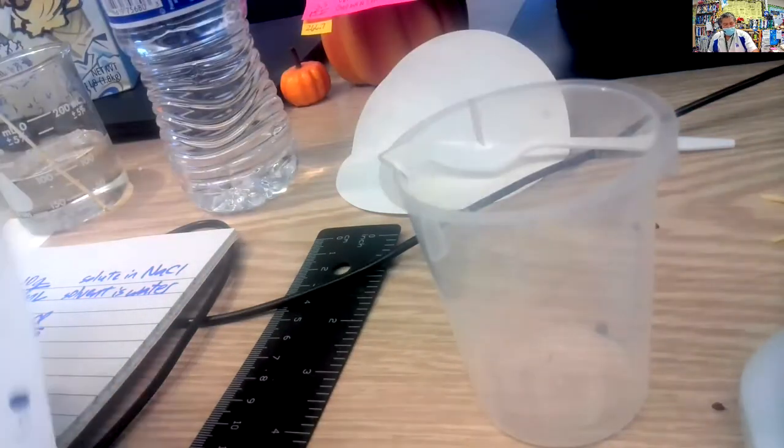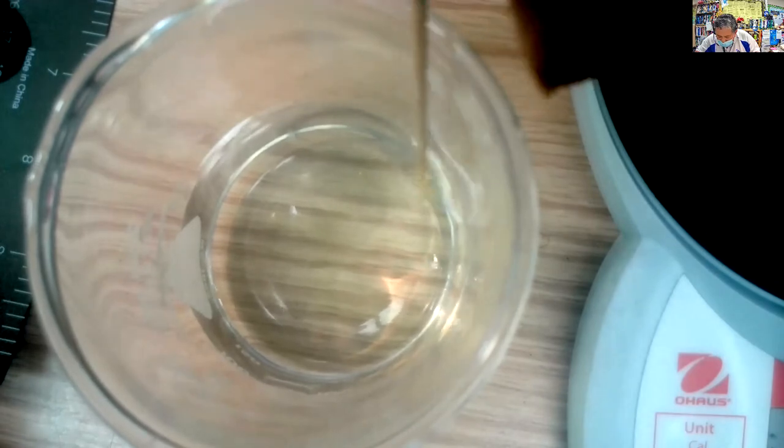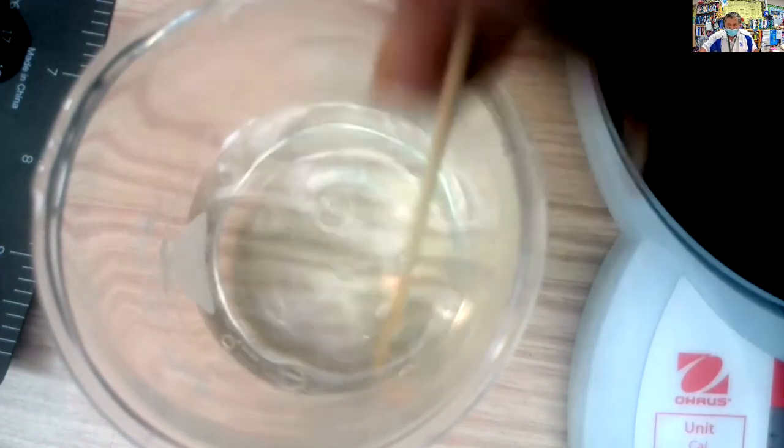Okay, so let's check on the salt water again. And it looks like it has dissipated. I don't see it anymore. Oh, I see one right there. It's about half gone. There's the other one. So still got a little bit of time. And so I'm stirring to increase the rate of the reaction there.